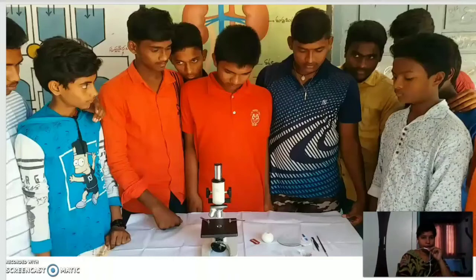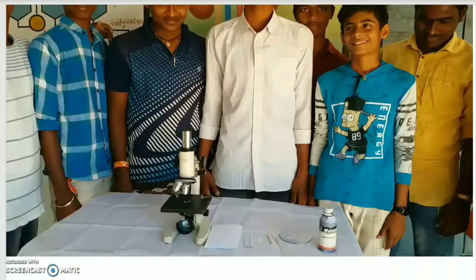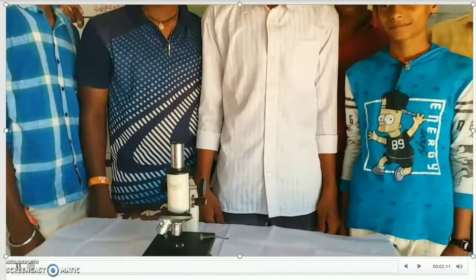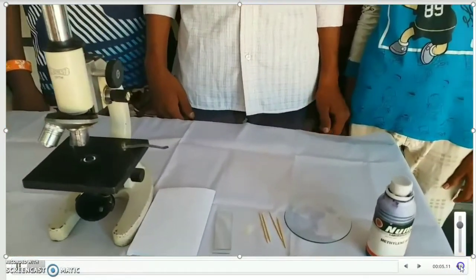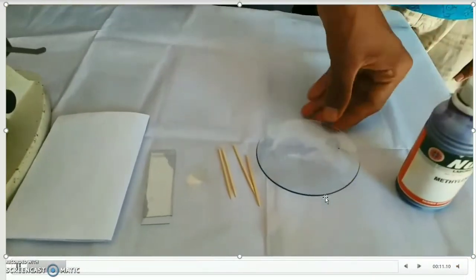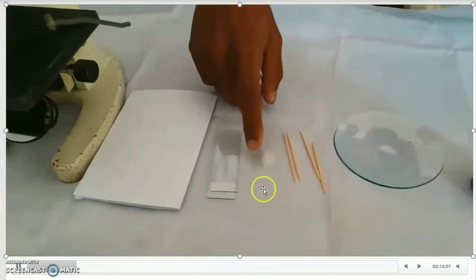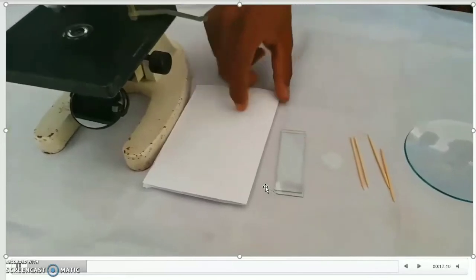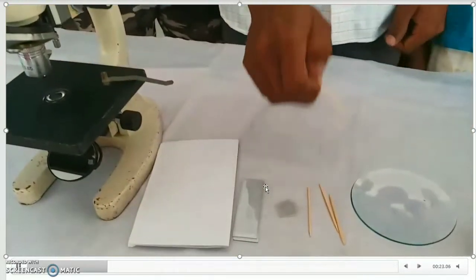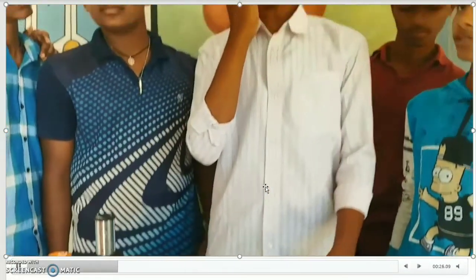Now I want to show you the cells present in cheek cells — animal cells. In this video you will observe the cheek cells. The materials required are: methylene blue, watch glass, toothpicks, cover slip, slide, white paper, and microscope. First, scratch the inner lining of your cheek carefully.